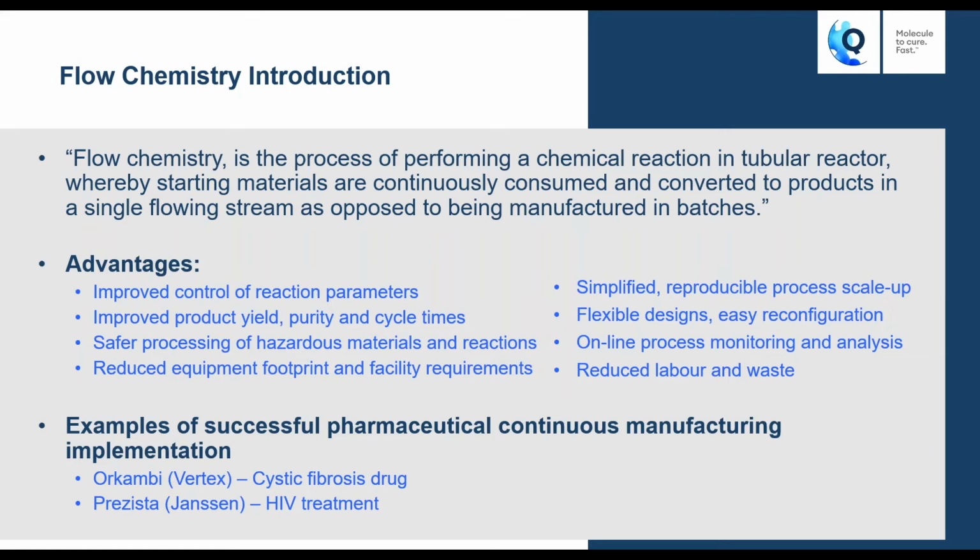As I said, you can simply put multiple of these units in parallel side by side and they typically take up laboratory size scale areas, whereas large pilot plants will typically take up areas of tennis courts or greater. They're very simple and reproducible once you've established the conditions for the process. And while there are commercial kits out there, they are all very flexible in the design and they're easily reconfigured to your process. So you don't have to shoehorn your synthesis into the equipment. You can develop the equipment around the process that you need.